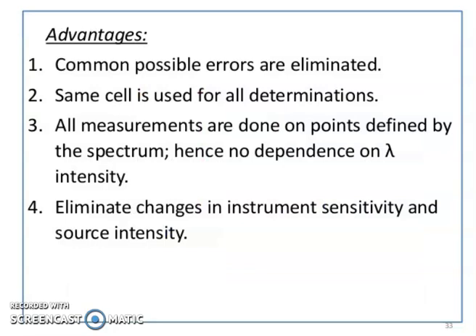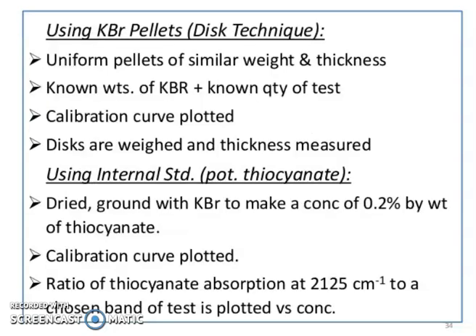What is the advantage? Common possible errors are eliminated. The same cell is used for all determinations. All measurements are done on points defined by the spectrum, meaning no dependence on lamp intensity, and eliminating changes in instrument sensitivity and source intensity.